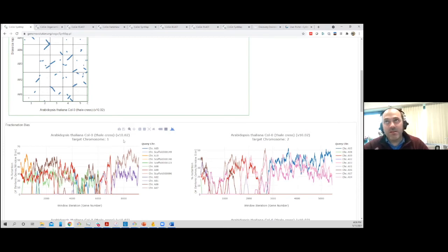Yeah, you would see 3 lines for each comparison. But here, you not only have evolutionary events that happen to Brassica, including this polyploidy, but you also have evolutionary and genomic events that happen to Arabidopsis. But if you scroll across, this is, again, chromosome 1 in Arabidopsis.